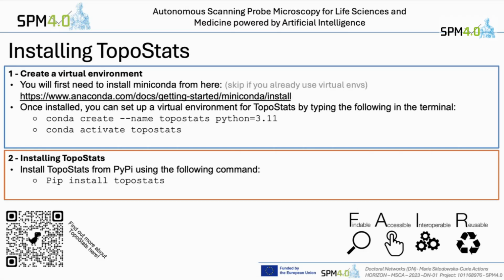Did you create a virtual environment with the right version? So these are the different virtual environments that we've got.